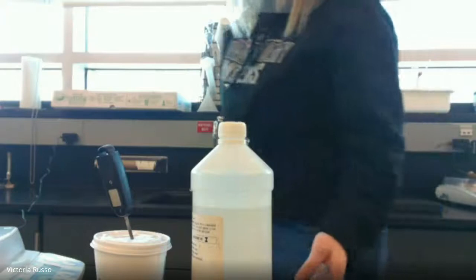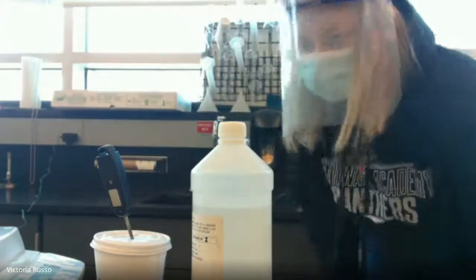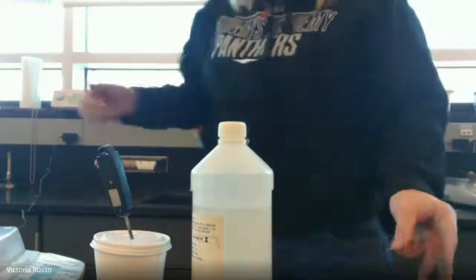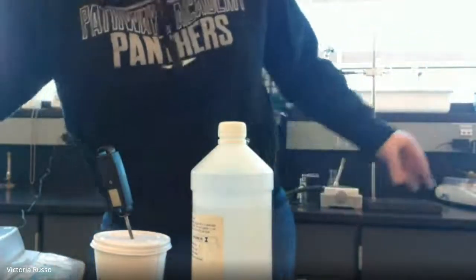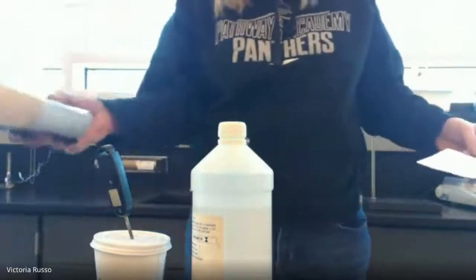Everyone. So now we're actually going to do the lab. Hopefully you watched the first video. I'm going to be reading the procedure to you and doing the steps. So step 1 says using an electronic balance, which we have right here.